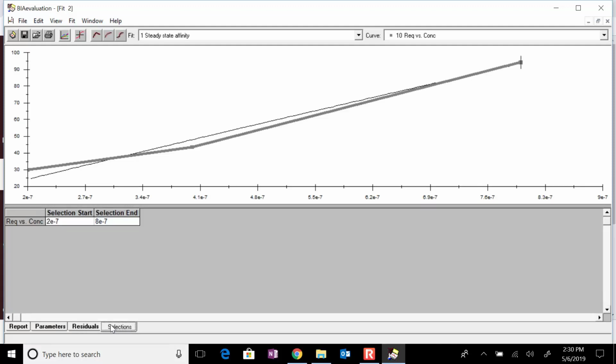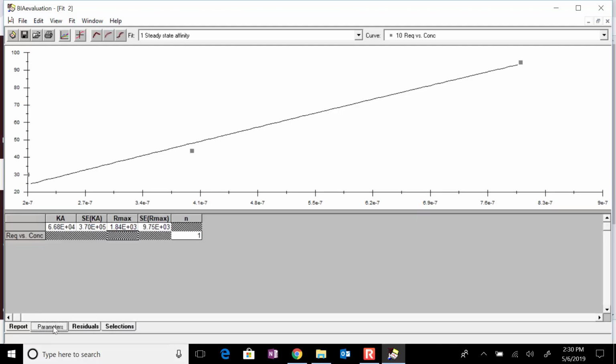But you can see there's some other things you can click on. But the important thing is once you get to this, you've got your numbers. If your standard error is like 10 to 20% of your Ka, then you've got a good fit. And this is the other way around, right? So this is not a good fit, but I will spare you the details of going back and forth, reselecting stuff. Maybe that cutting out that bubble didn't work. It looked like the bubble one was sort of not fitting with the other ones.